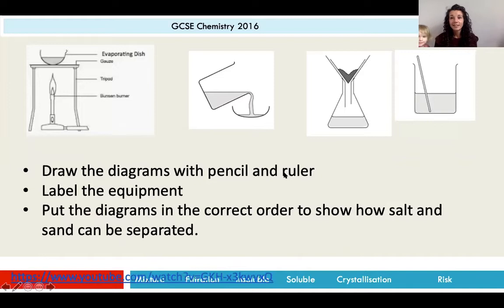Okay, so the next thing that I'd like you to do, please, is we are going to watch a video. So we're going to watch a video of how to carry out filtration and then crystallisation in a lab so that you can separate out sand and salt from a mixture of sand and salt when they're together. Okay, so what we'll do is we'll just watch the video first, so don't worry about doing anything just yet. Ideally it would be great to show you this in a lab, or even better, you could do this in a lab, and you've probably done this at some point at Key Stage 3. All right, but we'll have a look at a video of somebody doing it in a lab.